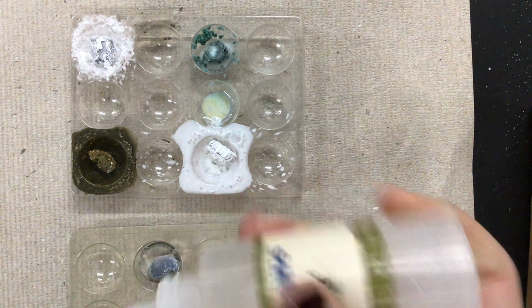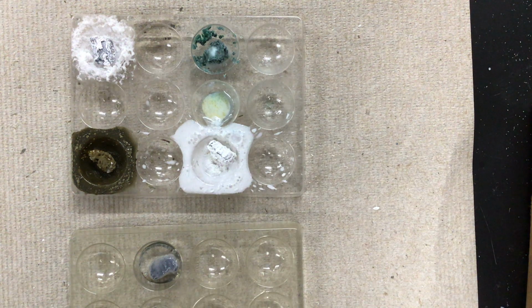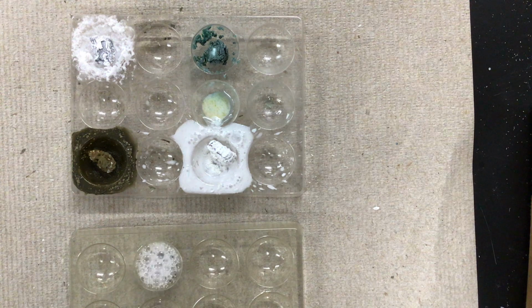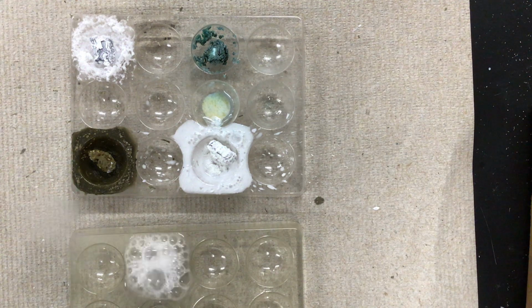Let's see if it's the same as the others. We're going to give it a minute because we can see that there's a gas that's starting to happen. So the reaction is getting going. Just like the other ones, there's a gas being produced. It's starting to kind of smoke. There it goes.